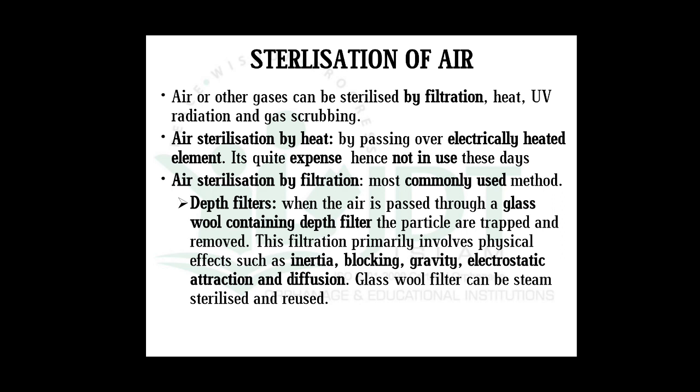It is quite expensive, so it is not used nowadays. The most commonly used sterilization method for air is the filtration method, which can be done by using different types of filters, like depth filters, which are composed of glass wool, where particles are trapped and removed. This filtration primarily involves physical effects like inertia, blocking, gravity, electrostatic attraction, and diffusion. Glass wool filter can be steam sterilized and reused. So that is the depth filter.